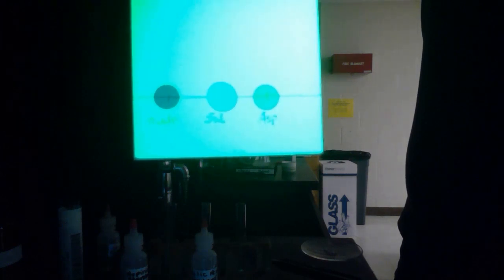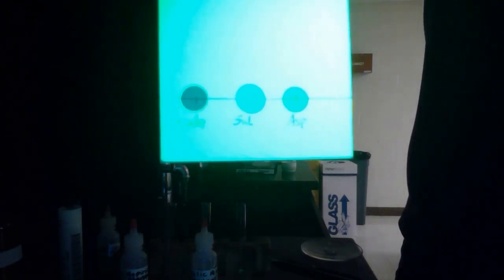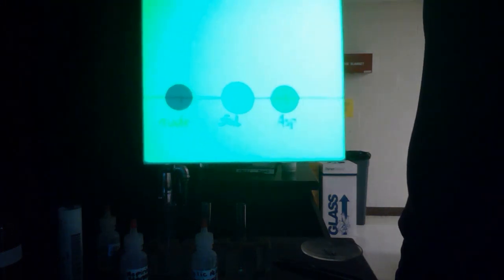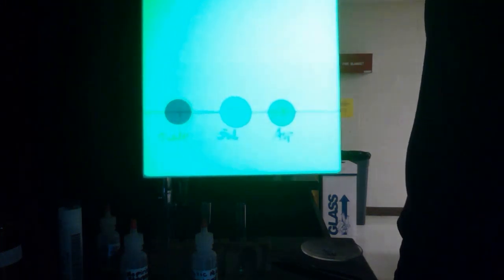Here we have the three spotted substances. You can see the made aspirin, the salicylic acid standard, and the aspirin standard, and this is visualized with the UV light.